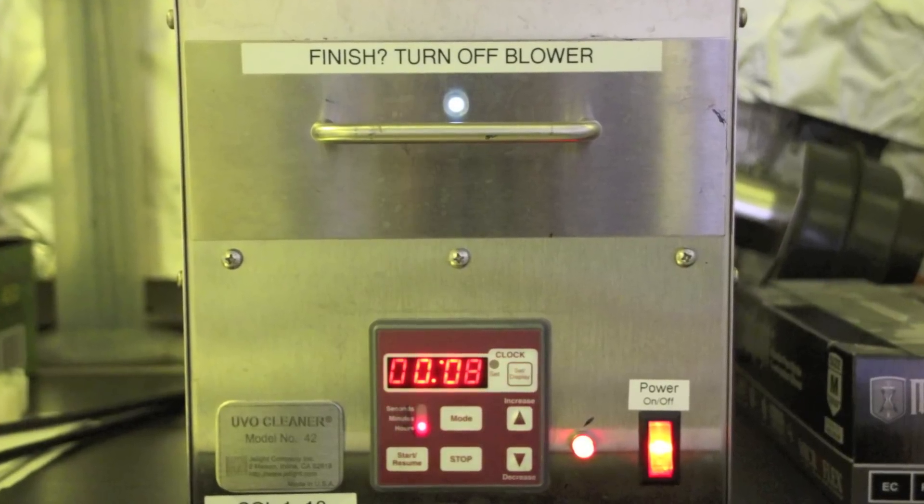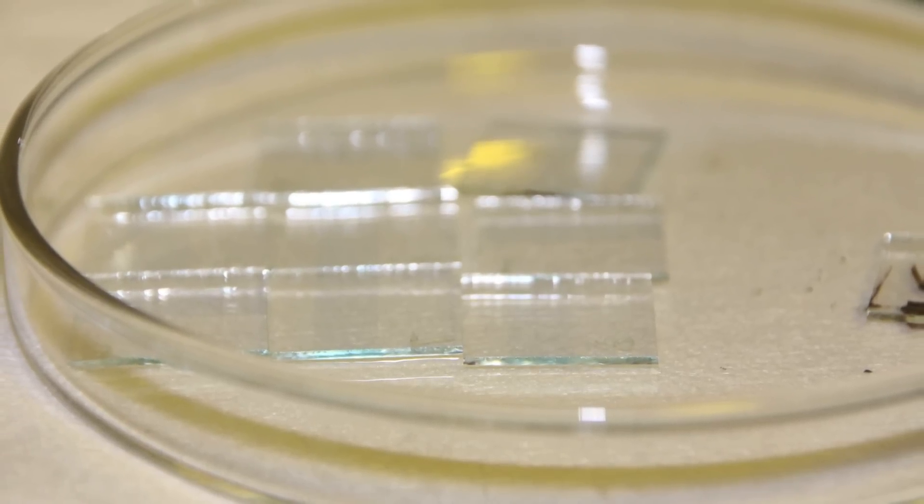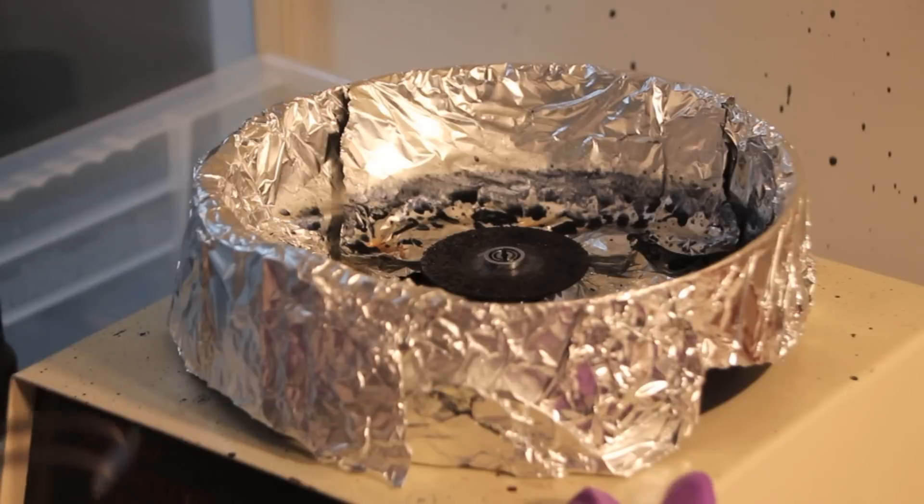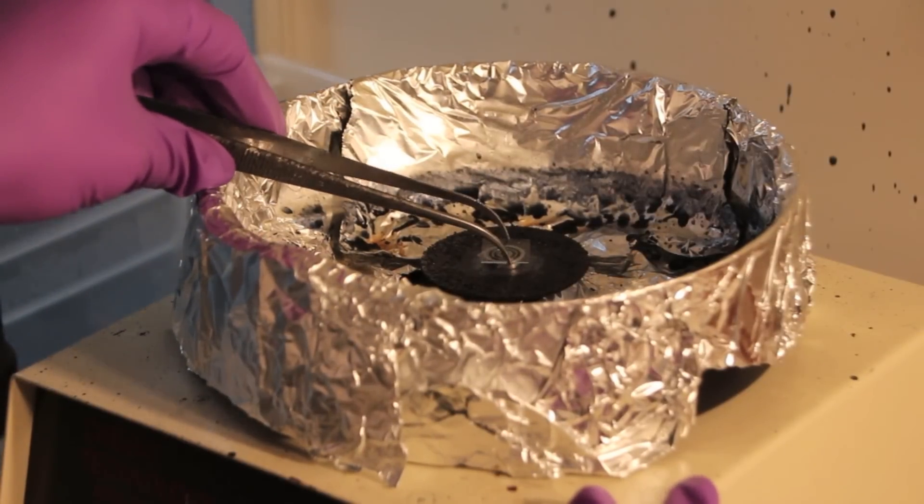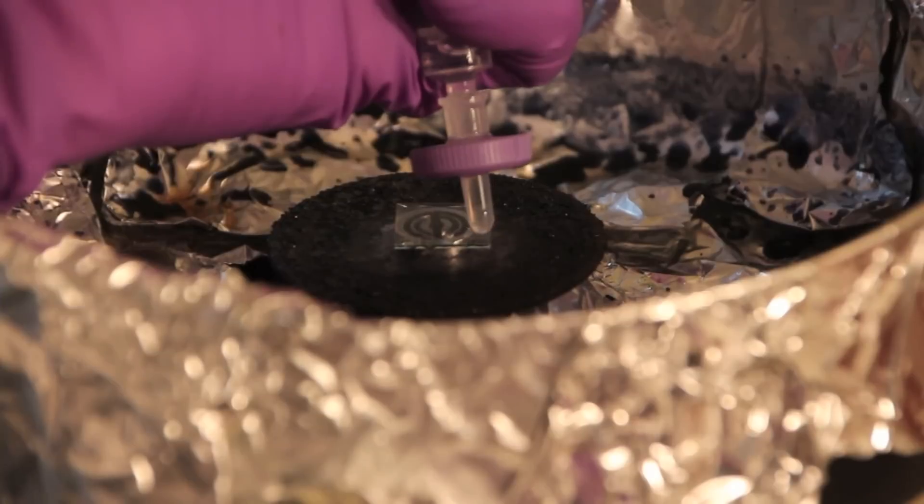Next, a UV-Ozone treatment is carried out on the patterned ITO substrates for about 10 minutes. After this, an electron transport layer is coated onto the substrates which are then thermally annealed on a hotplate.